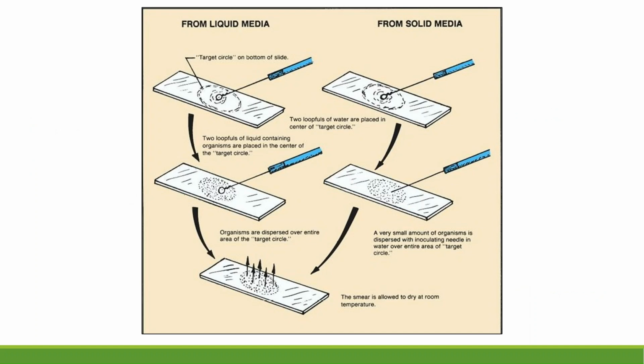Much like a bubble wand, you would dip into the liquid in order to blow bubbles. You're going to dip that inoculation loop into the liquid, and it's going to form a very thin film across that loop that can then be dabbed onto the slide and smeared around into a very thin, small circle. A quick examination under some light should show a very, very faint smear.